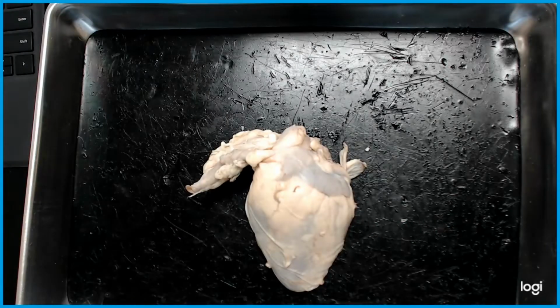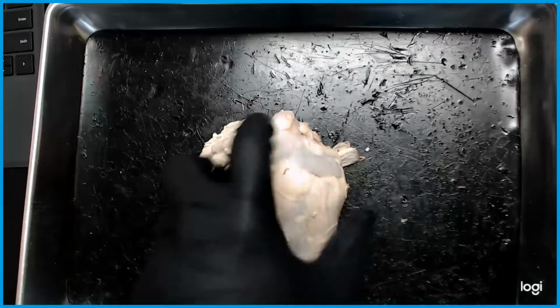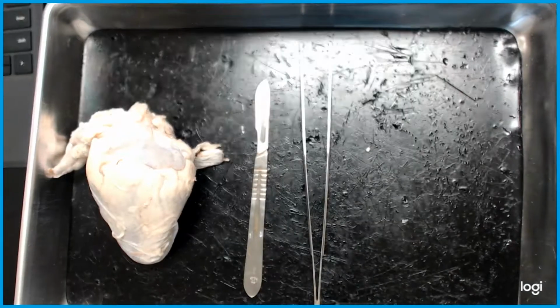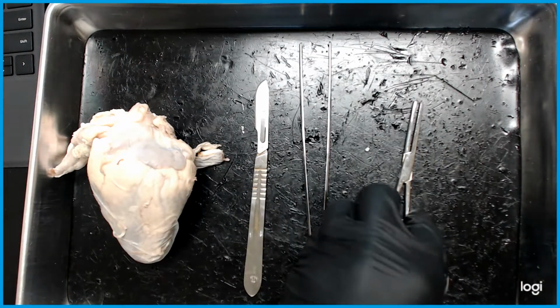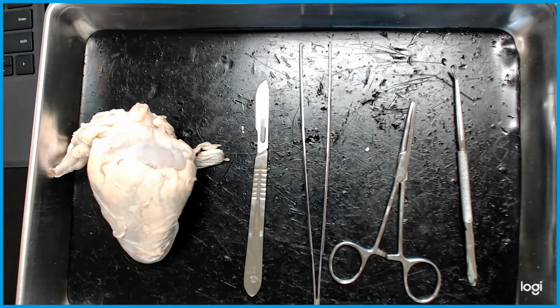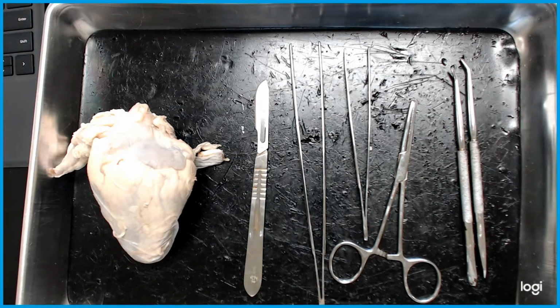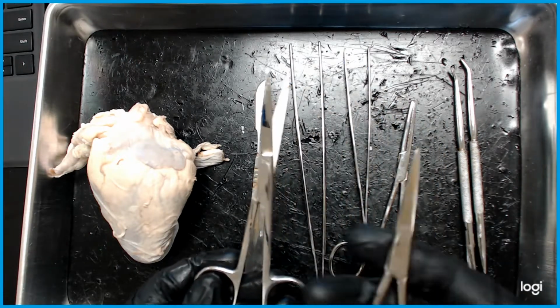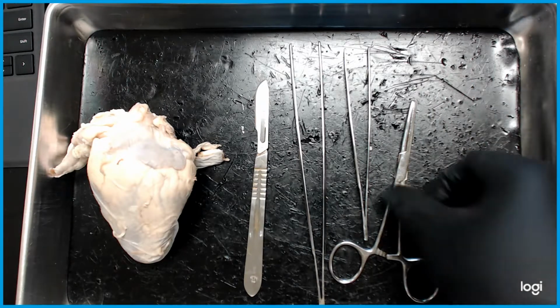Today we're going to talk about the sheep dissection of the heart. Instruments that we're going to need: scalpel, forceps, hemostats, probe. It could be any variation of this. It could be a smaller forceps, maybe a second probe in this case that I might be needing to show you. Scissors, we can either go with big or small. So it all depends on your comfortability with using these specific instruments.